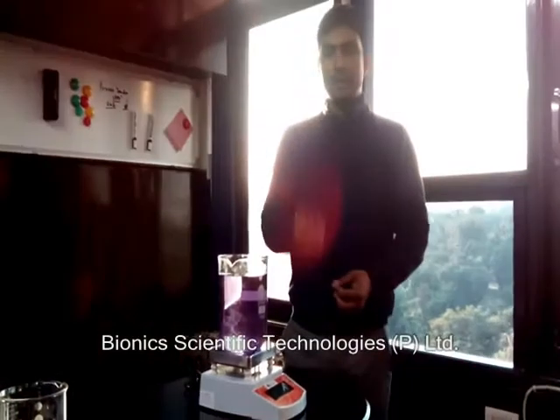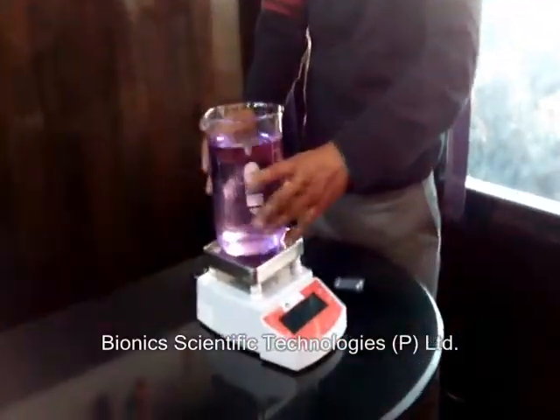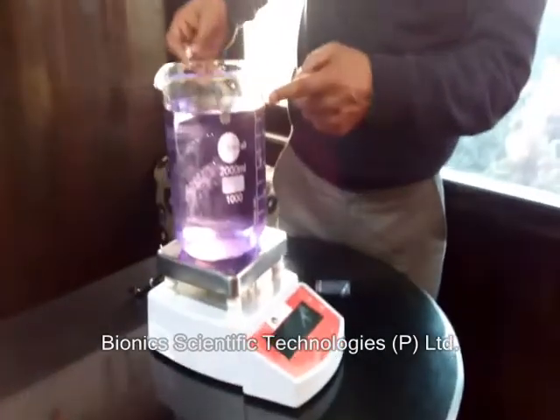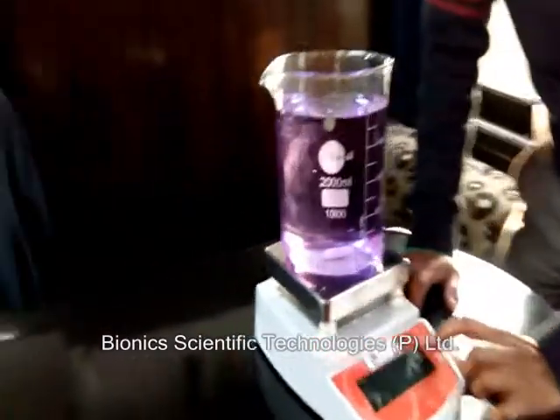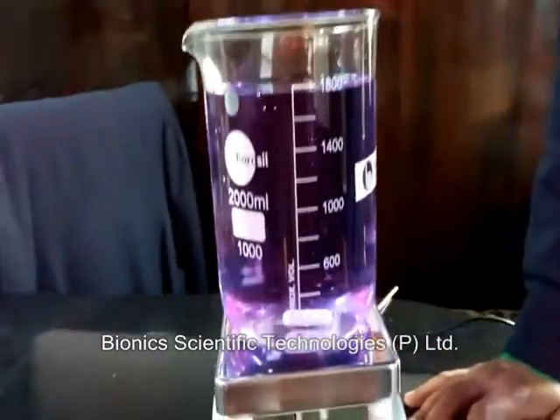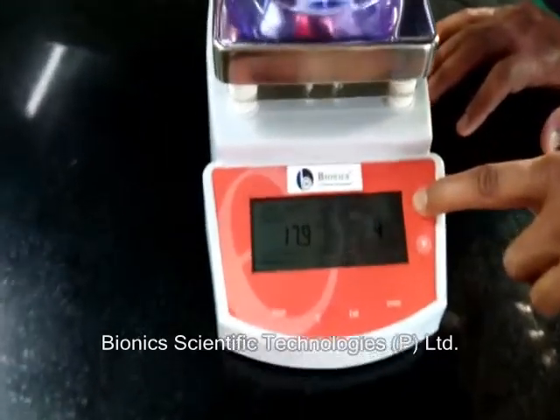We have to put this magnetic bar into the vessel — you can see this is a 2000 ml container. Now we can start the stirring by pushing one, four, five.